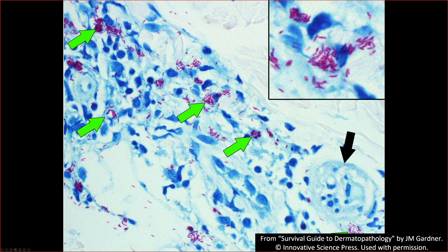Look at that loaded Wade-Fite stain with acid fast bacilli. You can see a nerve and the organisms are right in the nerve itself, around the perineurium, in the cytoplasm of the histiocytes — everywhere. Lepromatous leprosy is multibacillary. The other classification scheme uses paucibacillary and multibacillary — I like that because it's simpler. The lepromatous form has tons and tons of organisms, as opposed to the tuberculoid form which is usually paucibacillary with few organisms.